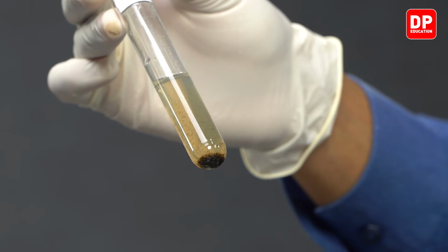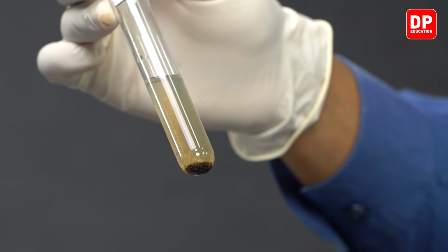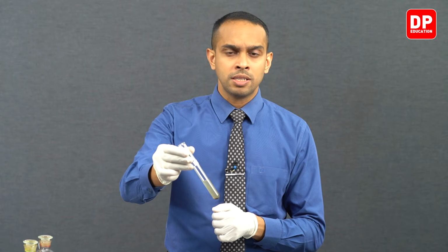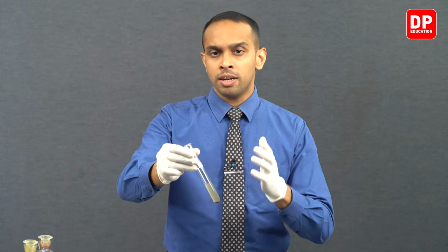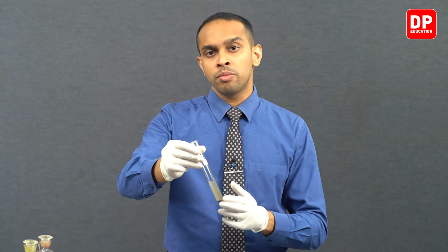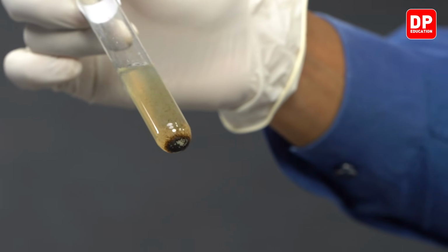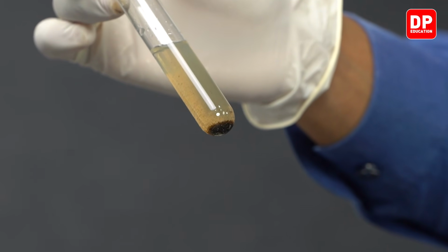So students, this indicates the presence of thiosulfate ions. This is a good test that you can use to identify the presence of thiosulfate ions. As silver ions are added to a thiosulfate ion solution, initially a white color precipitate will be observed, but almost immediately this white color precipitate will start changing its color and it will form black color silver sulfide precipitate. So you can see at the back of this test tube, silver sulfide, black color precipitate is formed.